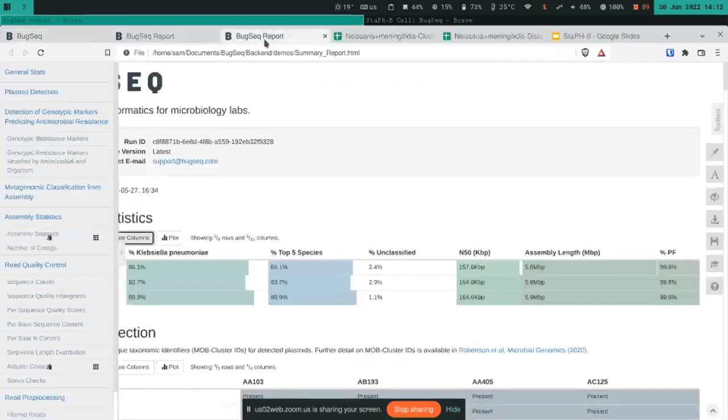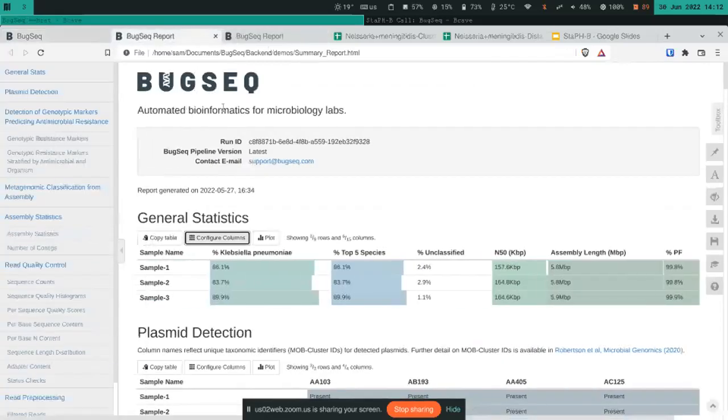And then this is what I'm going to skip here. This is what the analysis results look like. So it outputs a bunch of HTML and PDF files, which are cleanly organized in the UI. The HTML and PDF mirror each other. And it's basically reports, because we want to tailor this for public health microbiology labs who are used to just having reports, where it's not this interactive, kind of hard to archive thing.